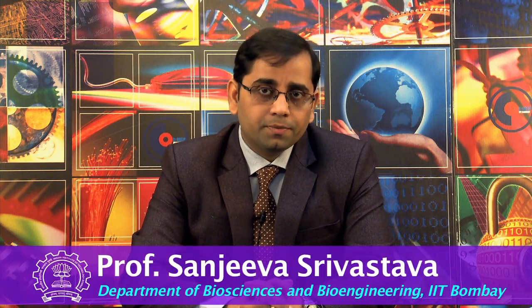So I hope you got a better understanding of this label-free biosensor, Biolayer Interferometry technology, BLI. The next lecture will include a demonstration session that was conducted during this workshop. I am sure you will now be able to understand these concepts much better, and you will also understand how to perform these experiments for your biological samples of interest, for your biological problems of interest. Thank you.